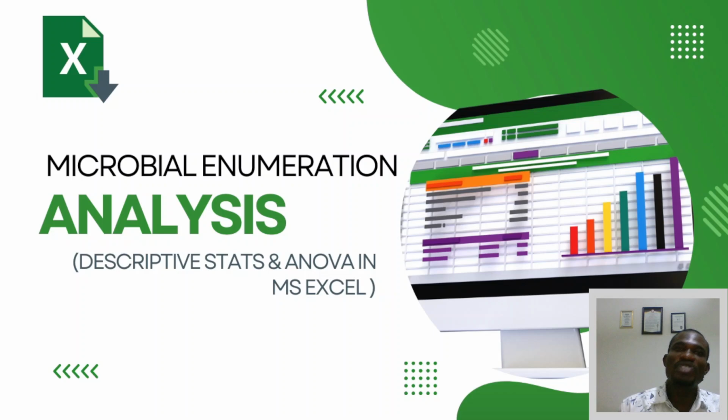So it's based on this variance that we can go on further to analyze for the variance. That's the ANOVA, the popular ANOVA many of us have heard of, analysis of variance. So before you can analyze variance, you need to have some sort of average or some sort of mean. So it means that your data set cannot just be one. You should have at least replicates, two data sets for one particular sample or three data sets for one particular sample or more. And based on that, you'll be able to find an average or a mean and find variance. And out of that, you can compare the means, either using ANOVA or other things.